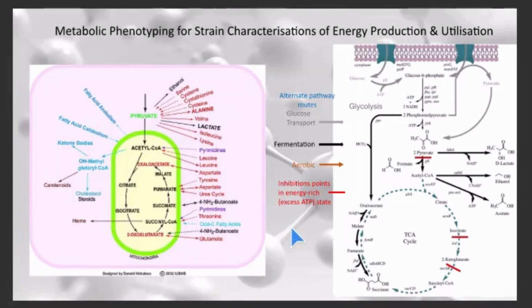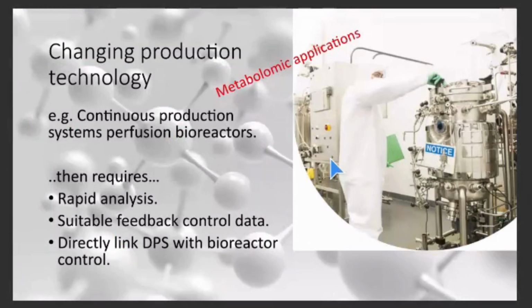All these things are very well served by measuring the metabolites that are occurring here, both in the cell and that's excreted into the medium, rather than simply measuring fairly blunt outputs like optical density as cells increase, or single parameters that we might want to measure and then try and extrapolate to what actually is a complex pathway. No, far better to actually measure directly what you want to understand is changing within your system.